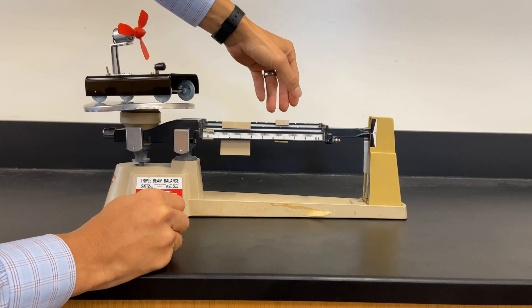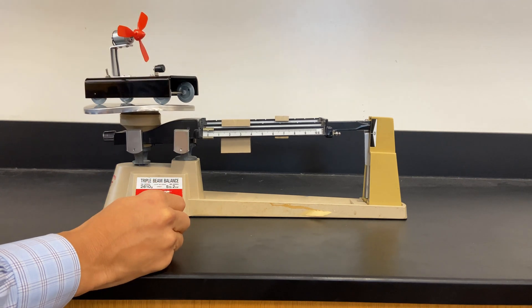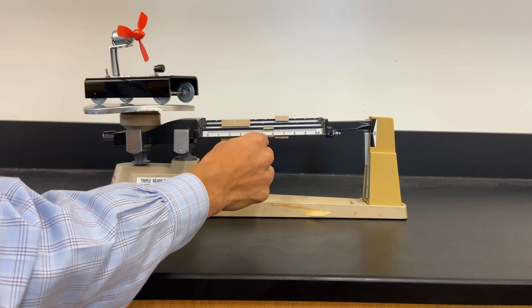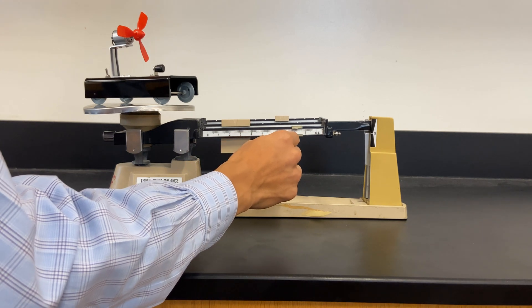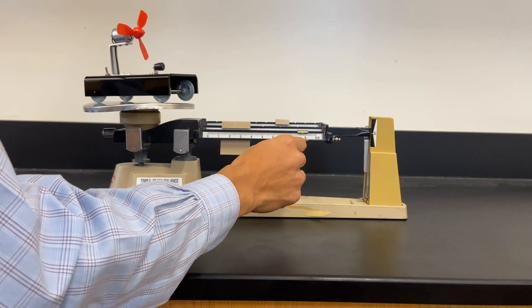At 70 it doesn't go down, so we go to 80. At 80 it does go down. So we're going to tap that and just want this to balance.